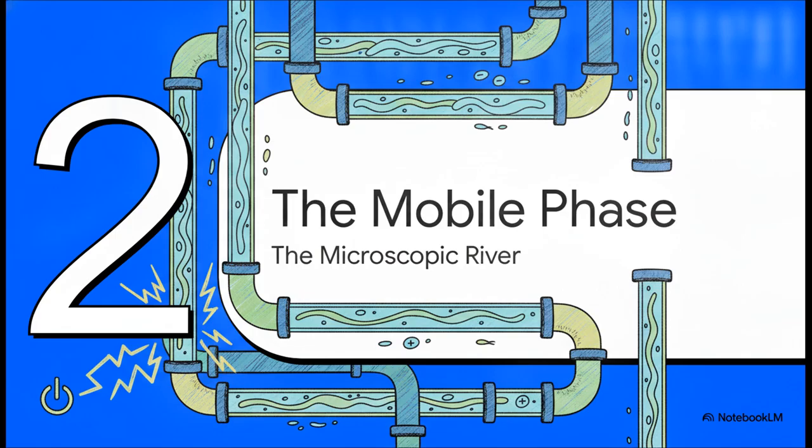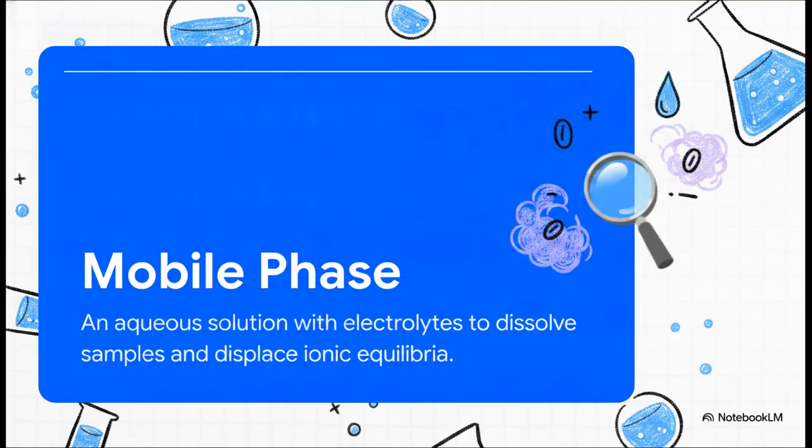Section 2, powering the mobile phase, the microscopic river. Okay, so here is the thing. The mobile phase is not just plain water. By definition, the mobile phase in ion chromatography is an aqueous solution containing a very specific concentration of electrolytes. In this medium, the solutes from our sample and the functional groups of the stationary phase inside the column become perfectly ionized. And there's a really fascinating detail from our sources here.